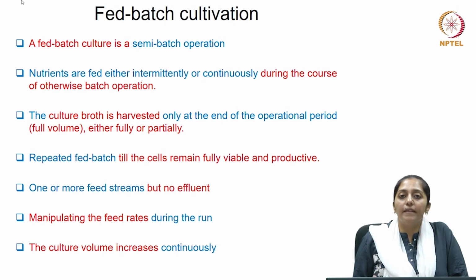One must also decide how long the feeding is to be continued, which means in what way the feeding is done, whether you would like to do it intermittently as pulse feeding, or continuously as step feeding once started, or keep varying the flow rate throughout the feeding following a trend like exponentially increasing feeding and so on.